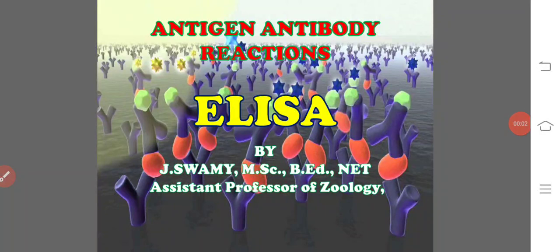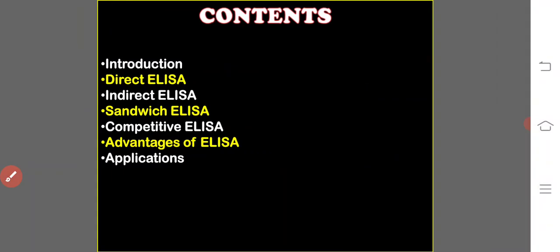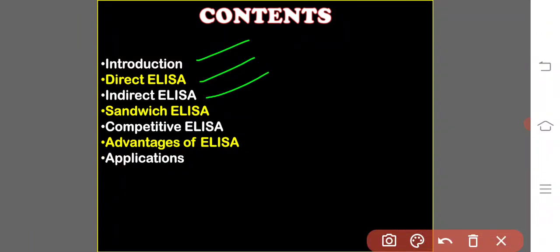Hi viewers, in this class we are going to discuss the ELISA apart from the antigen antibody reactions. Under this topic we are going to discuss introduction to ELISA, types of ELISA tests, direct ELISA, indirect ELISA, sandwich ELISA, competitive ELISA, and the advantages and applications of the ELISA test.